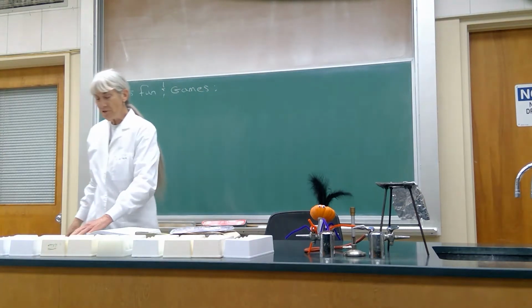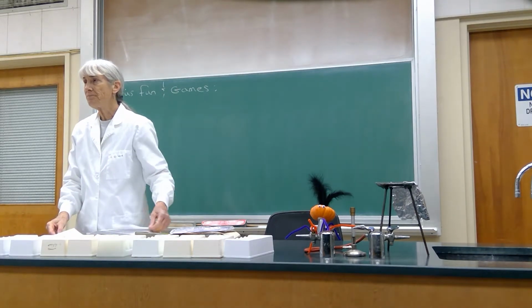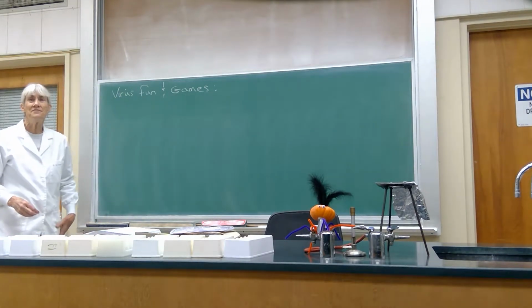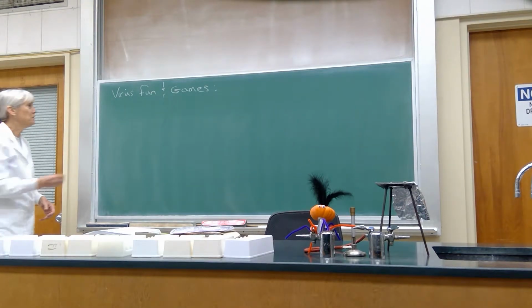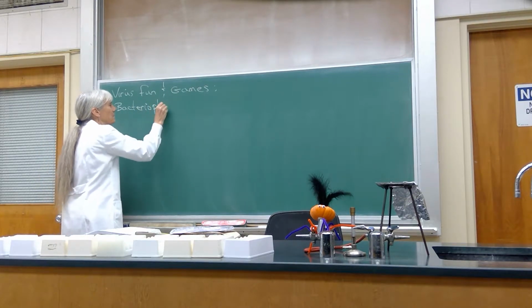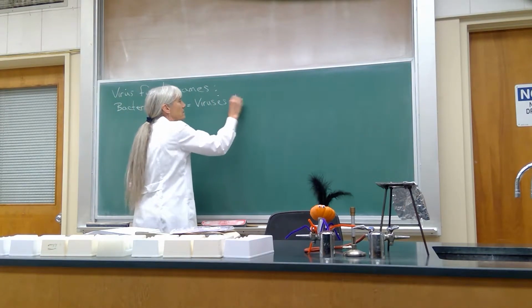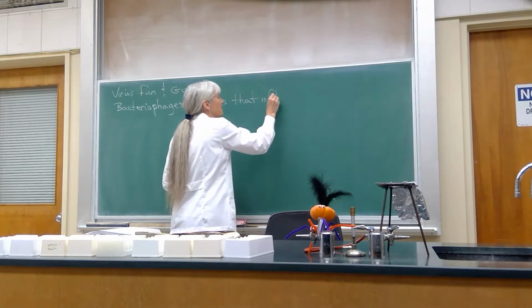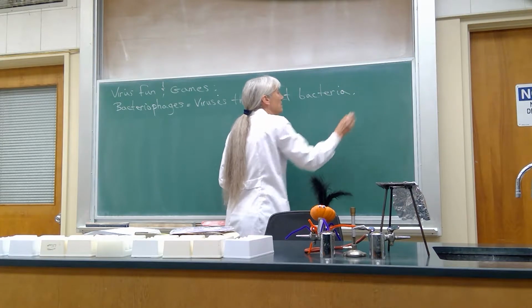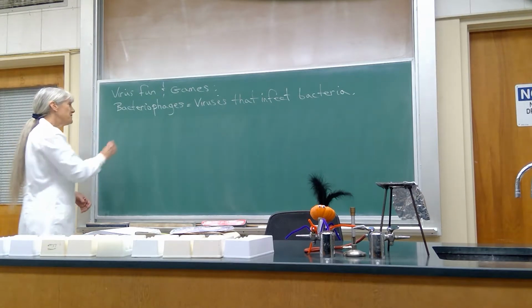Probably the most important thing to remember about the viruses we're working with is that they are bacteriophage. And what are bacteriophage? Viruses. Right, they're viruses that infect bacteria. They cannot infect you. One of the things that I told you about bacteriophages is that they tend to be very host specific.